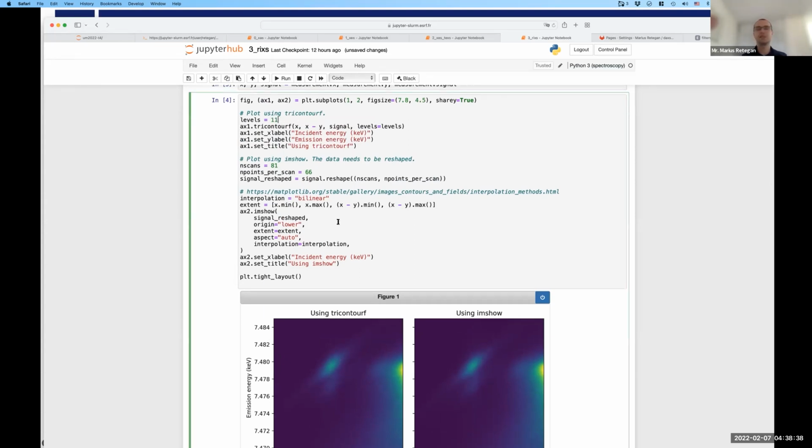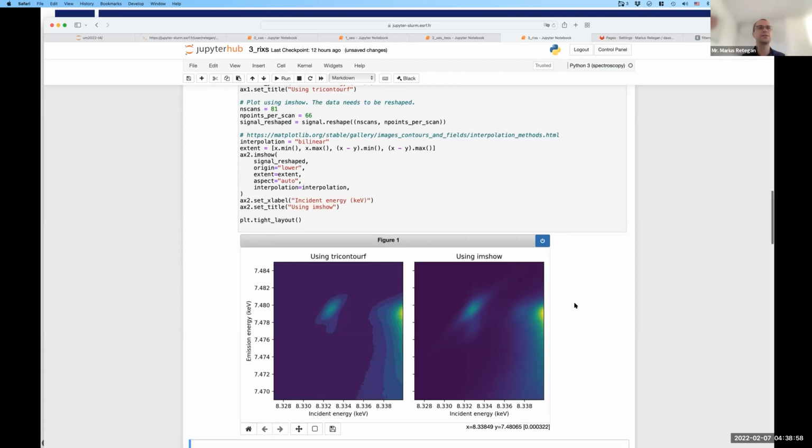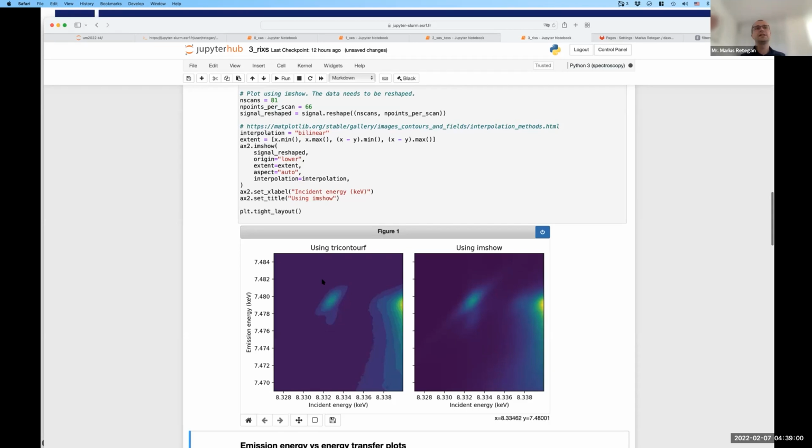First, I'm going to change the number of levels. Here I changed the number of levels of the plot on the left-hand side. You already see that this looks different from what I had initially and from what I had on the right-hand side, which at the beginning were very similar. I hope you can see this via Zoom, but it has compression algorithms and so on. This is similar to what you would find in maps, where you have contour plots that usually represent altitude.